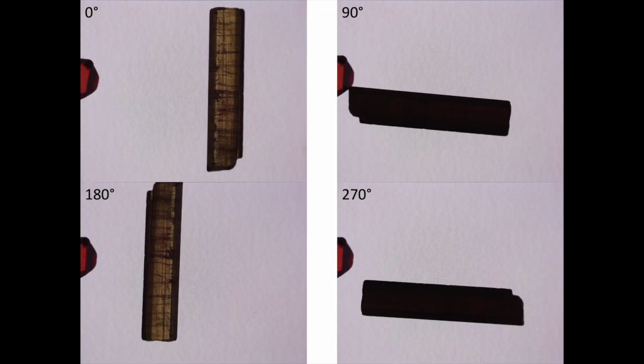Things get more interesting, however, when we look at the tourmaline, which is an anisotropic material, and in this case our tourmaline is going to be defined by 2 refractive indices. And so taking a look at the tourmaline crystal in plane polarized light, we have the following pattern. And what I want you to notice is that there are 2 end-member colors.